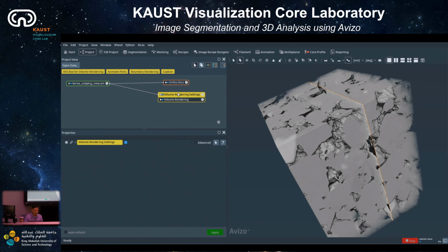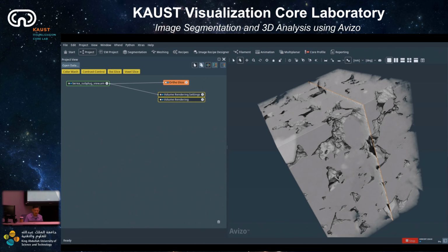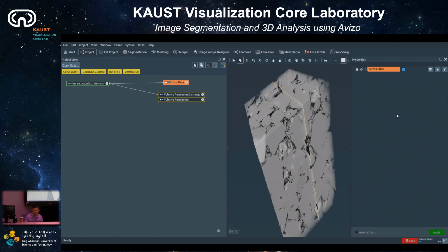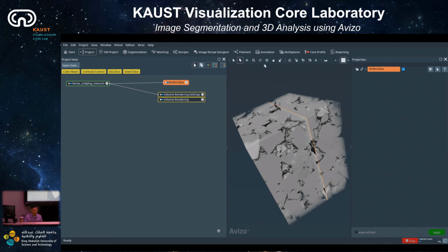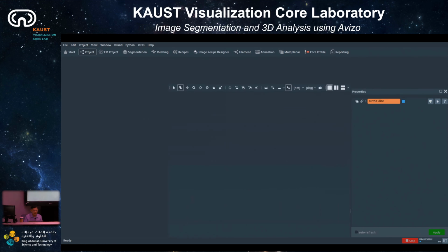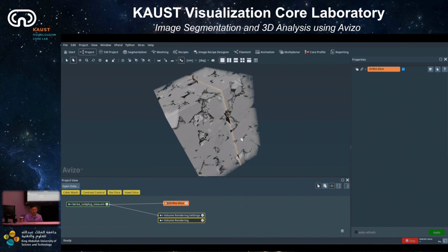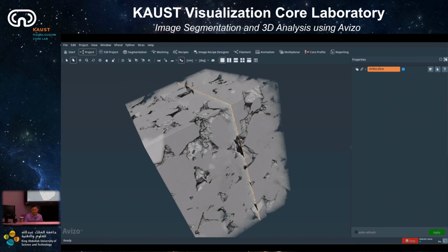And one of the things that you might come across is that you don't see any information of this data, or you lose it somehow. For example, you can change the docking of the property port somewhere here to the side like this, or you can just make it over here, or you can completely close it. As you can see, there are different ways of changing the layout, and sometimes you instantly close them like this.